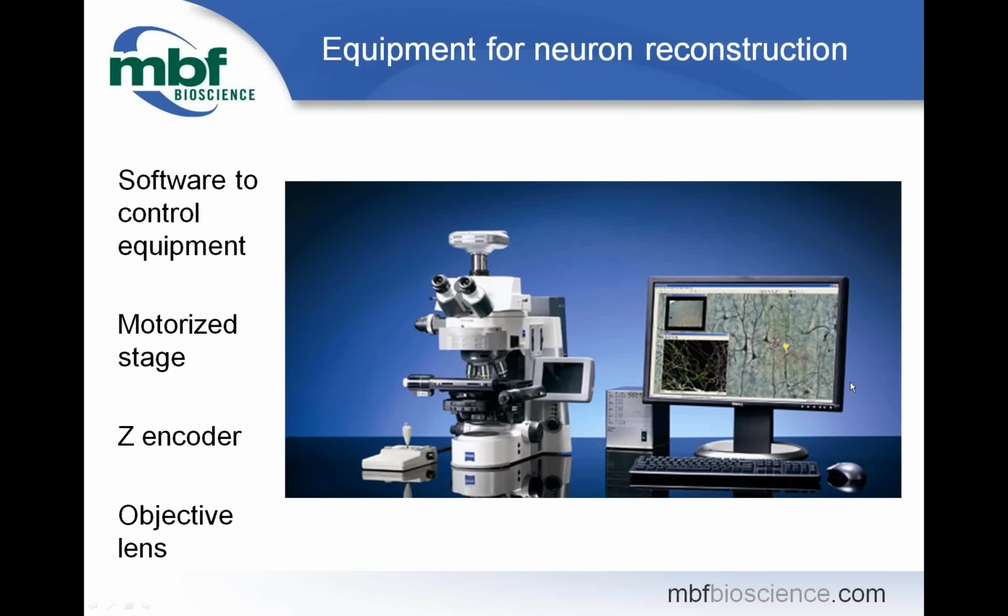Neuron reconstruction can be performed on image stacks that were collected either from a microscope that has Neurolucida installed on it, or you can import image stacks captured from a different microscope. In the case of importing image stacks, it's necessary to ensure that the program is configured with the proper XY scaling of the lens and the Z step used to acquire the image or image stack.